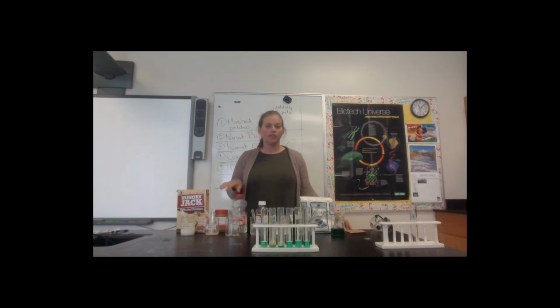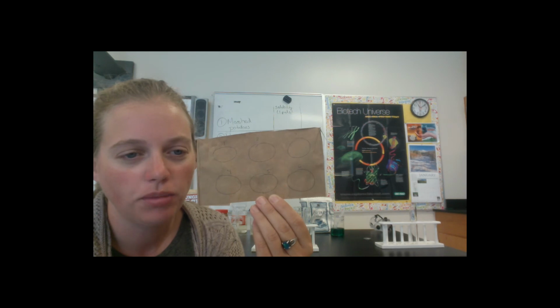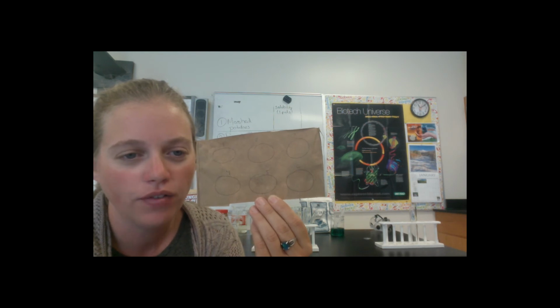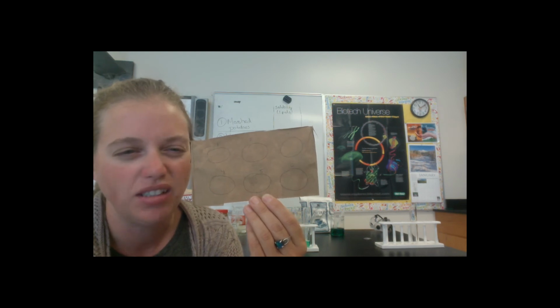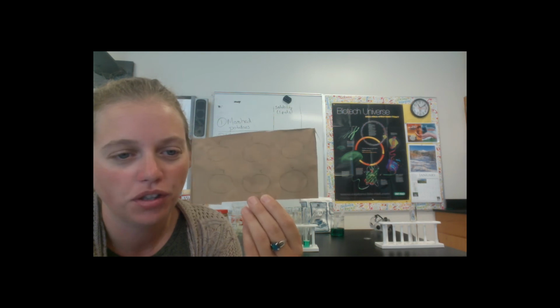We are also going to test these foods using what's called the spot test, and so I'm going to bring this a little closer. We're also going to be using what is called the spot test in order to test for lipids, and I bet you've done something like this before. If you've ever gone and gotten fatty fast food and left it in the bag overnight and you see that bag the next day, it's got all these greasy spots on it. And that's essentially what we're doing with the spot test, only we're using brown paper.